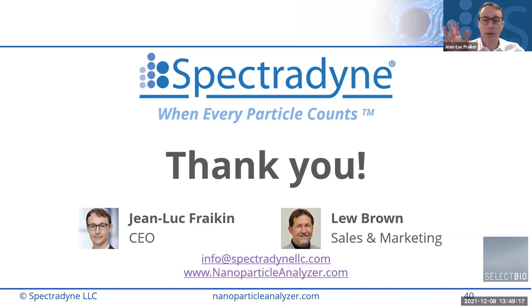Most of our users use Tween, and I saw a question come up about that in the chat we can talk about. Or there are a couple of alternatives. There's a poloxamer, also a surfactant, and you can just add protein like BSA, something inert, to your sample also. We have not experimented too much with organic solvents, but we're always interested in learning more. If you have a specific question, we've maybe tried it before, or we could try it out. Hopefully that answers your question.